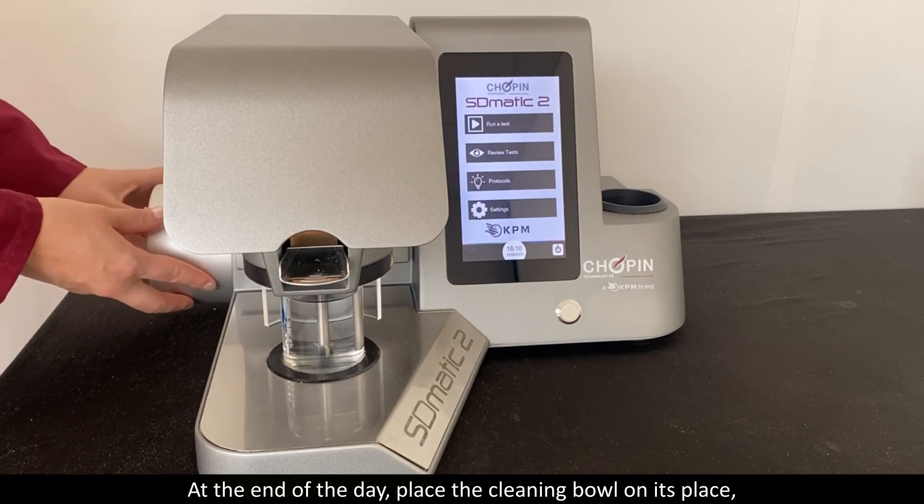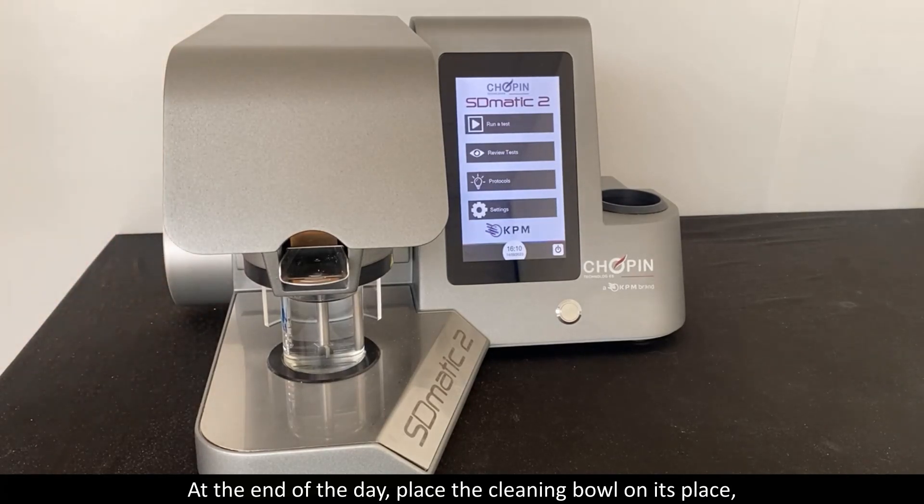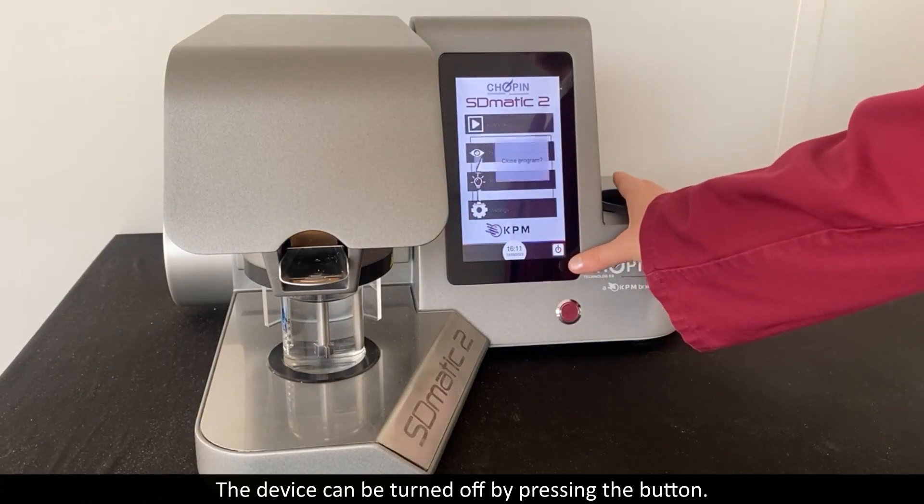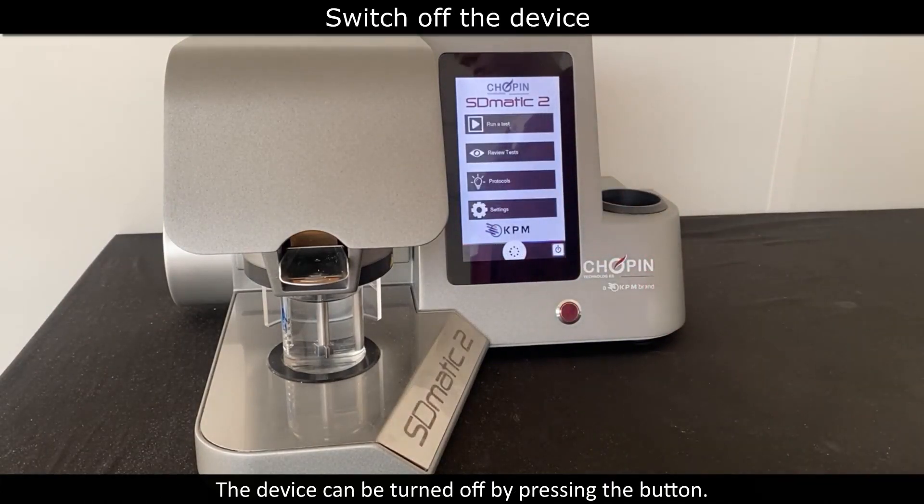At the end of the day, place the cleaning bowl in its place and make sure the probe rests in distilled water with the arm lowered. The device can be turned off by pressing the button.